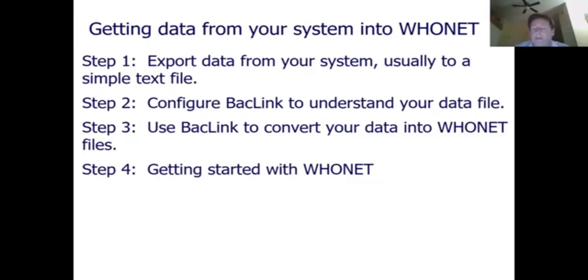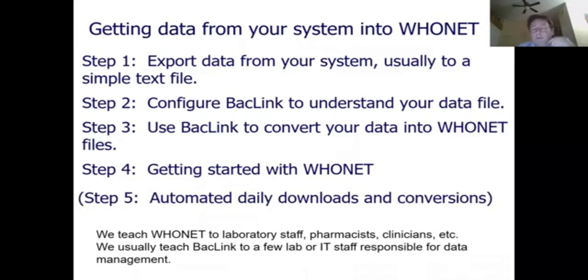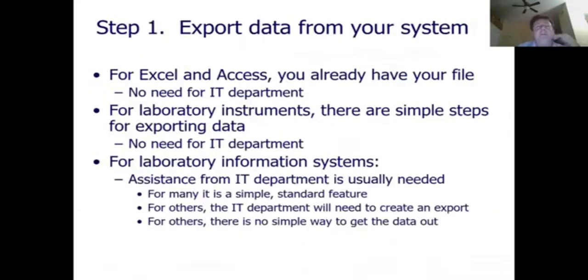Use BacLink to convert the data once a year, once a month, once a day. In my hospital, it's once a day, automatically. It's all scheduled. And then step four, getting started with WHONET. We teach WHONET to everybody: lab, microbiology, pharmacy, epidemiologists. We usually only teach BacLink to the one or two people responsible for managing the data, and automation, that's what we do in my hospital. So I'm only going to talk about step one here.